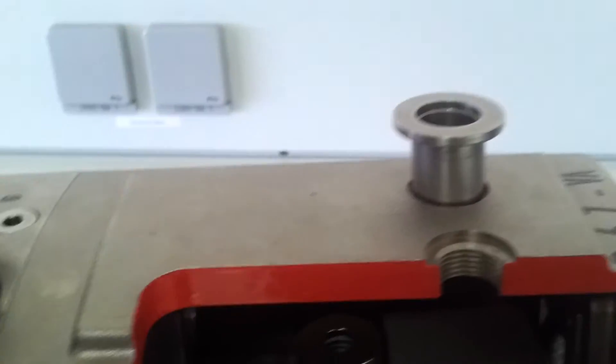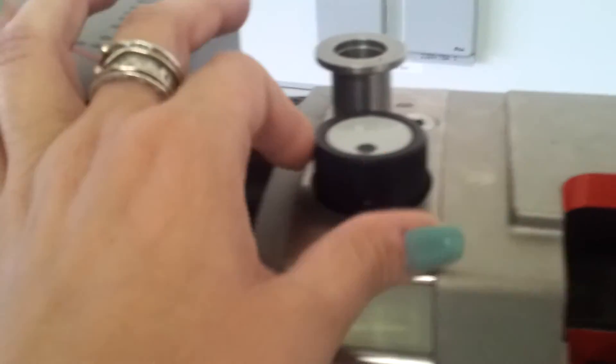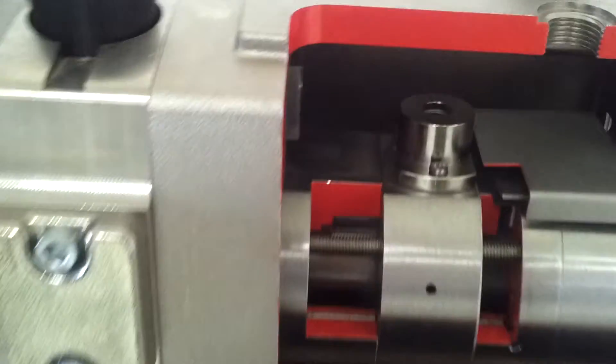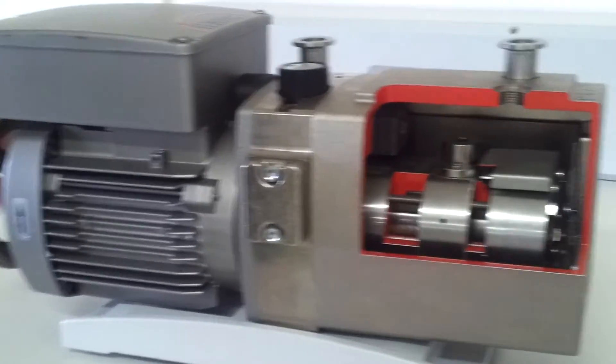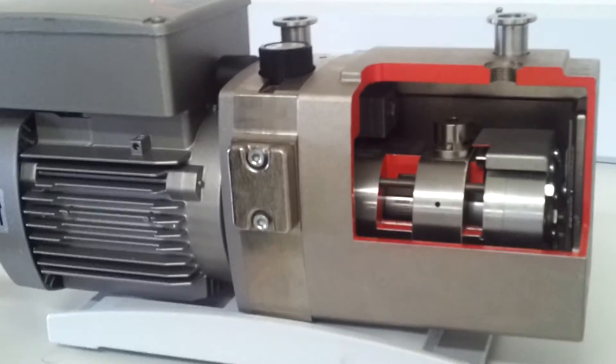Here are the connection hose and we have a gas ballast for cleanup after the work. It can reach 10 to the minus 3 millibars, so it's actually a very powerful type of pump.